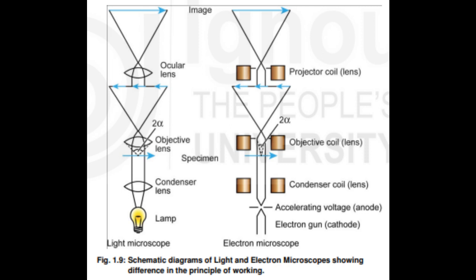Electron microscopy is of two types: transmission electron microscopy (TEM) and scanning electron microscopy (SEM). In TEM, the electrons are transmitted through an object, focused by the lenses to form the image, while in SEM, electrons are reflected by the object to form an image. 1.3.1 Transmission electron microscopy (TEM). The transmission electron microscope possesses high resolution.